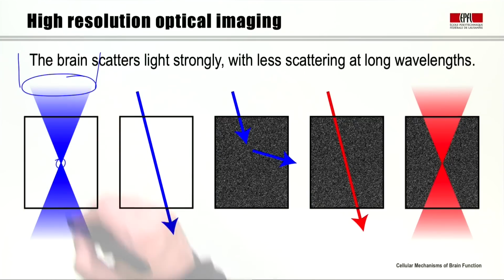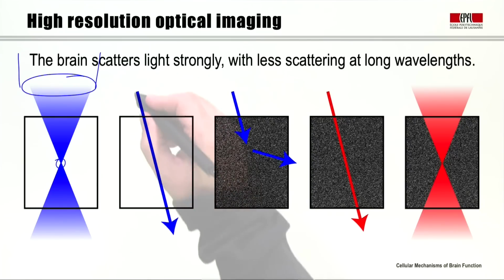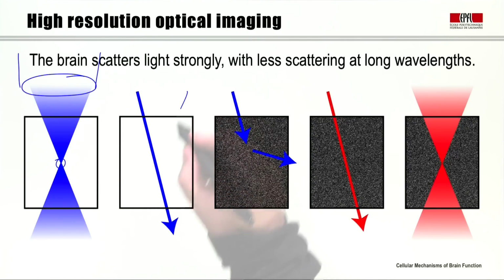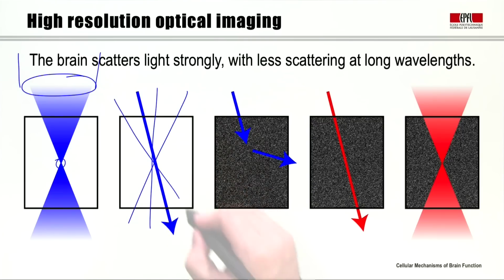And the reason we can do that is because the photons go through more or less without scattering through this medium, and so we can send in photons, all of which will intersect at the focal point of the microscope. And that we can then use for exciting fluorescence at one nice localization spot in the sample.